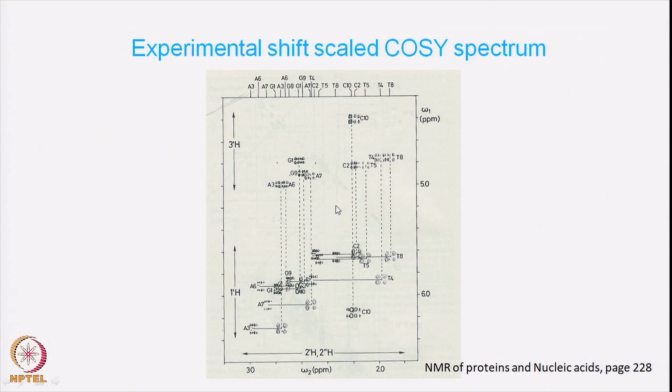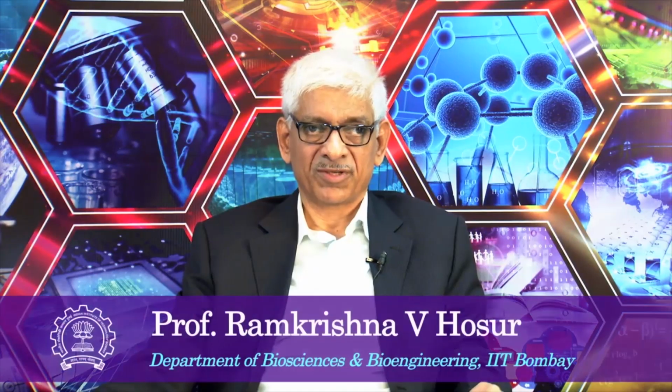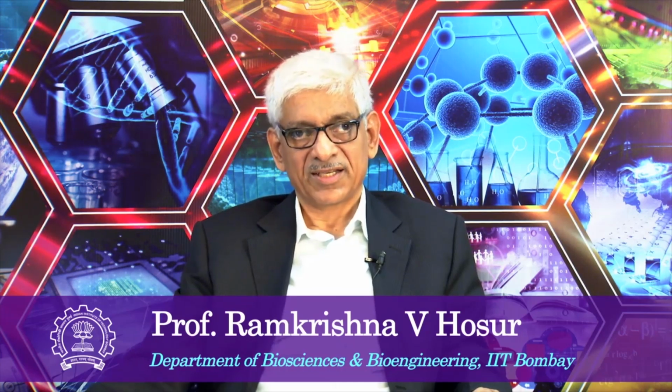So this is the application, and we will see later how to increase the chemical shift appearance in the spectrum, that is, how we can make the chemical shifts enhanced or scaled up. So we will see that later, and so with that we will stop here.